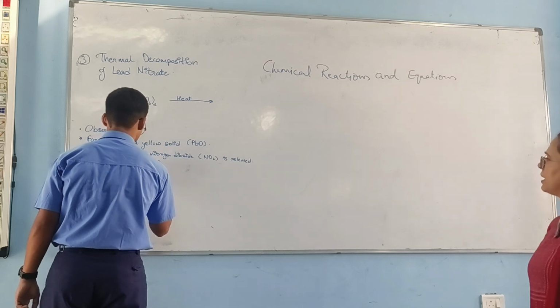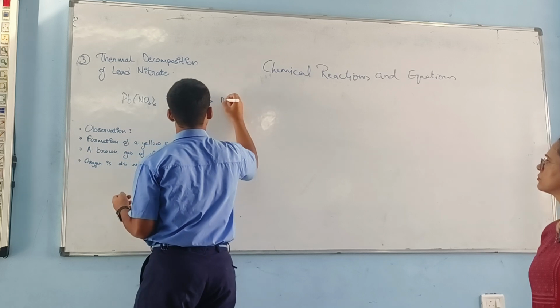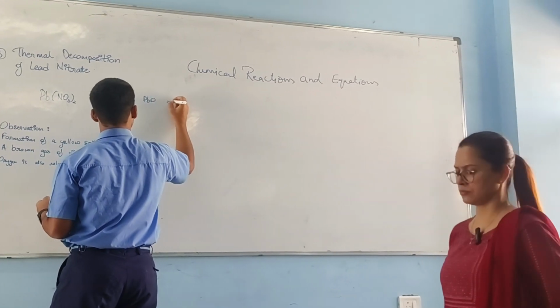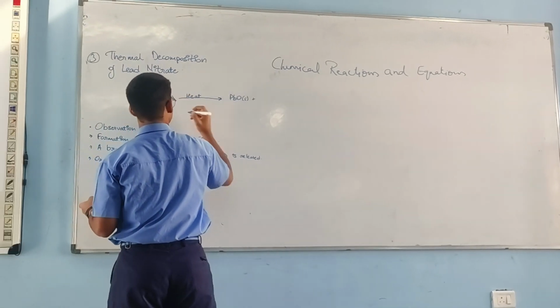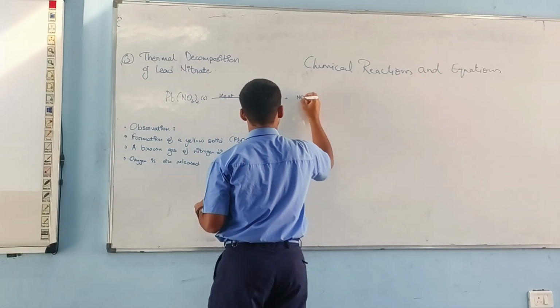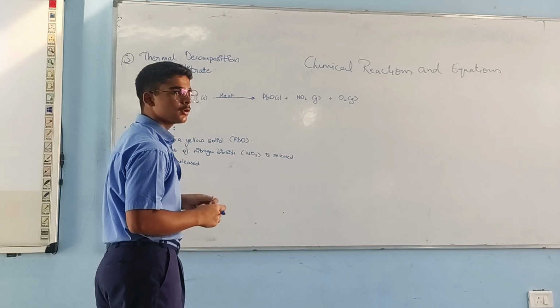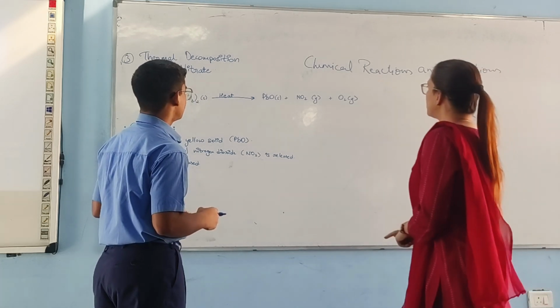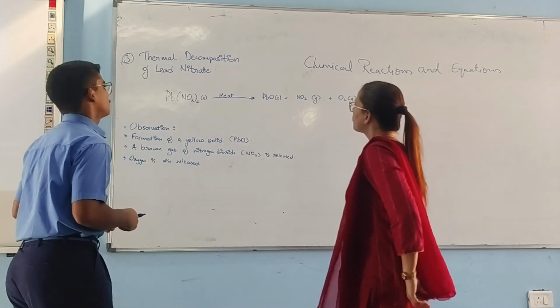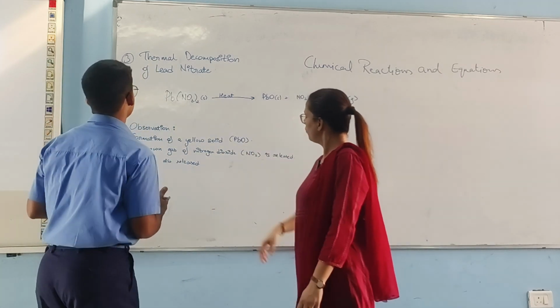Now you can complete the reaction. Anybody? You? Lead oxide. ठीक है, ठीक है. Just mention the colors here also.